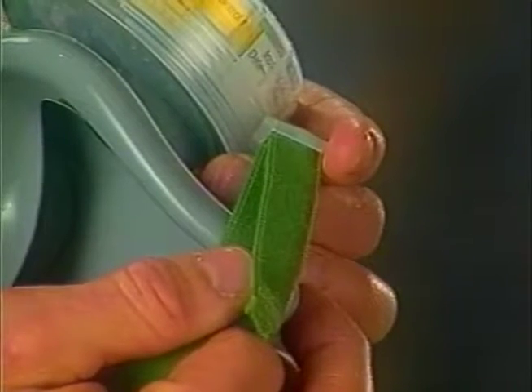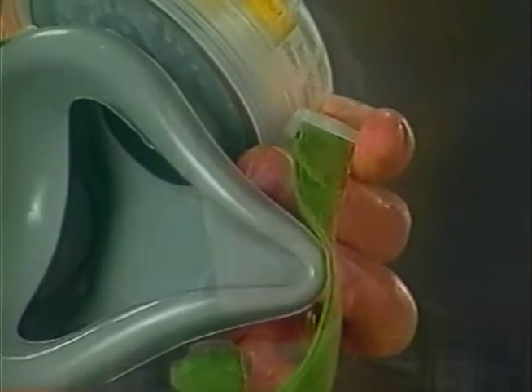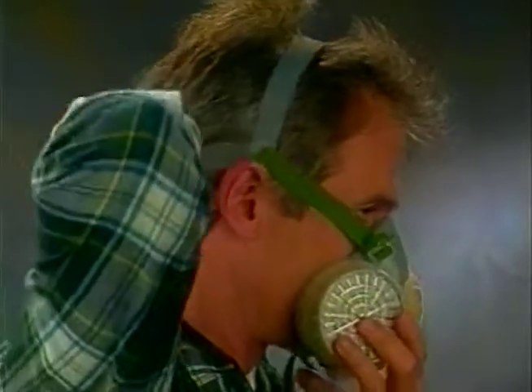Before donning the respirator, place the straps through the buckles for easy adjustment. Place the respirator on your nose and mouth, and place the head harness on top of your head. Position the respirator low on your nose bridge to get the best possible visibility. Grab the lower straps and tie them behind your head. Tighten the straps by pulling on the loose ends, starting with the top straps, and terminate with the bottom straps. Avoid over-tightening the straps.